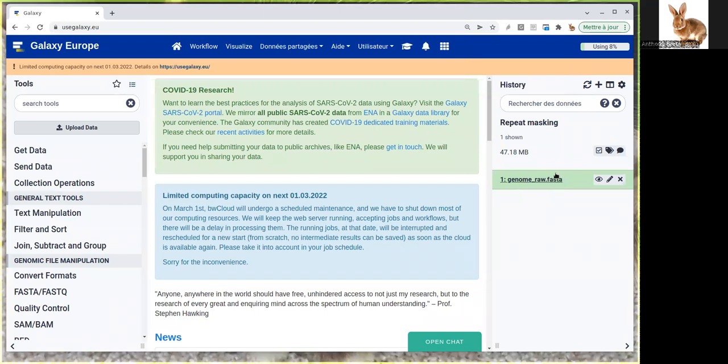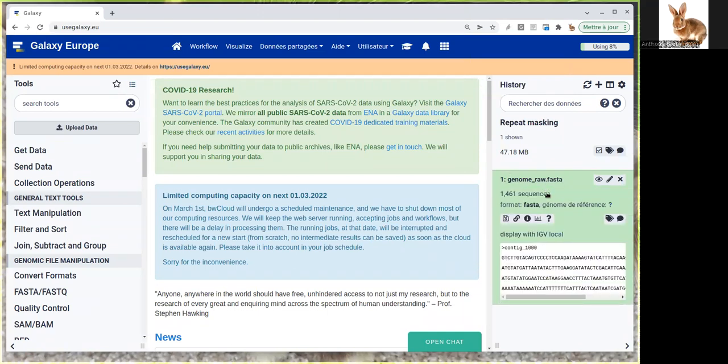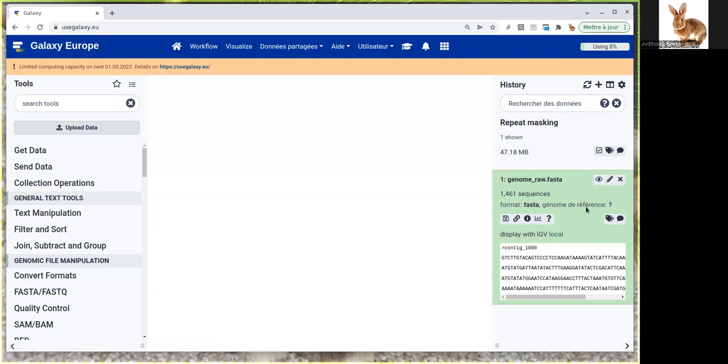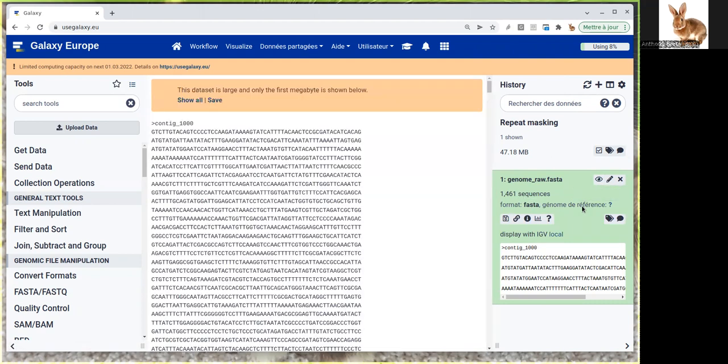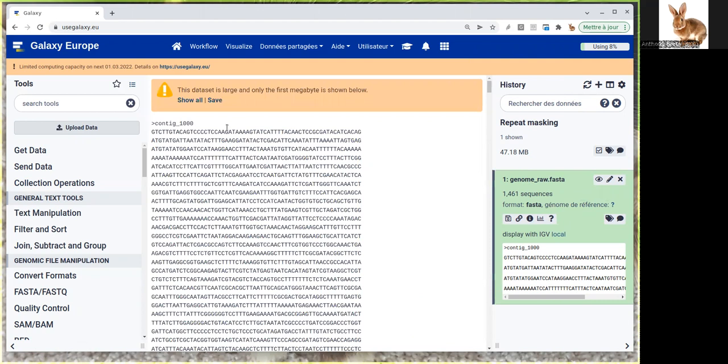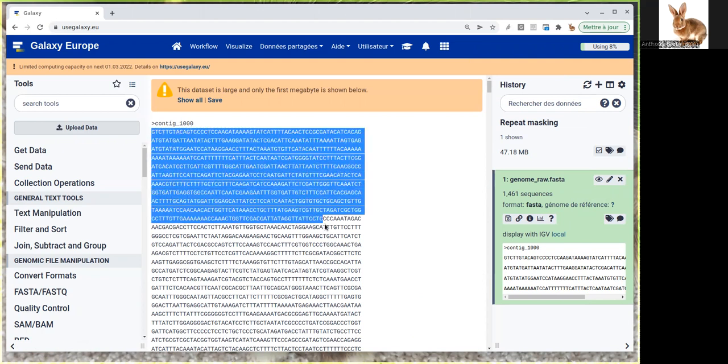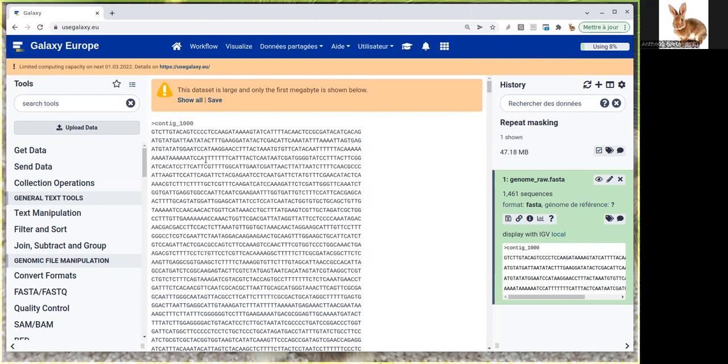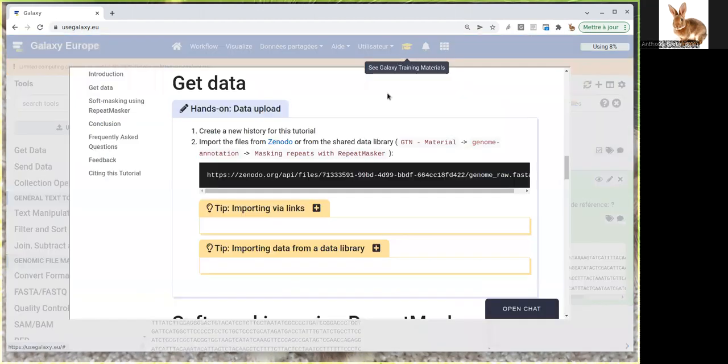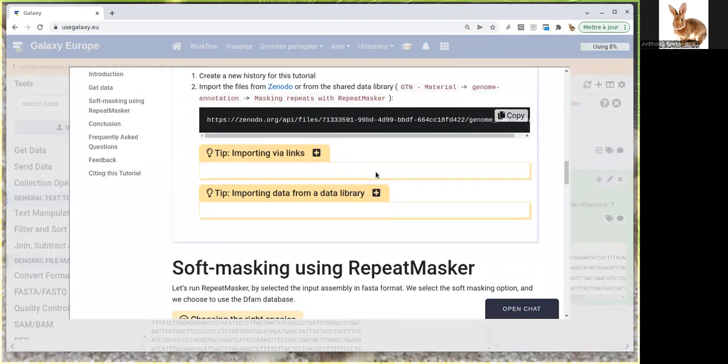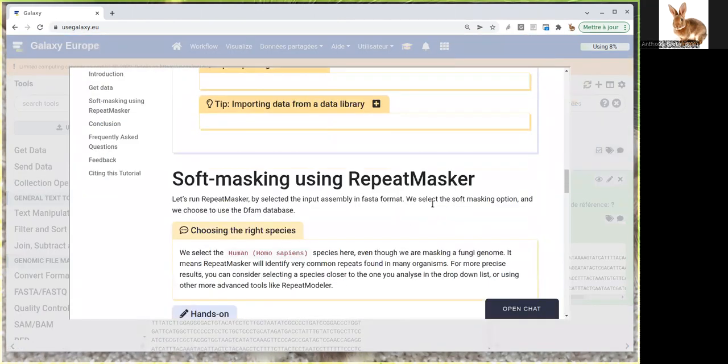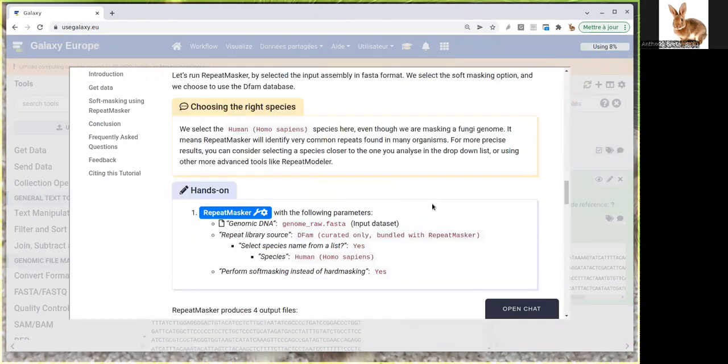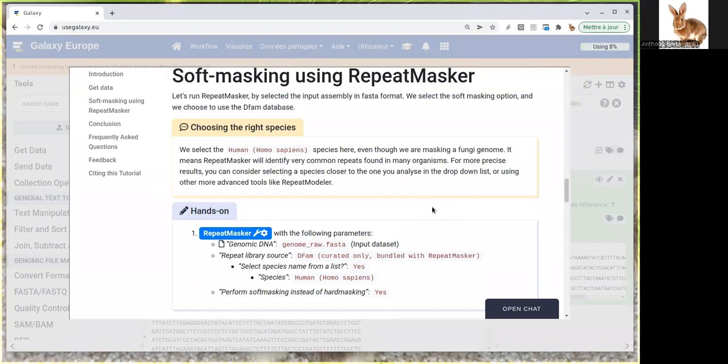Now that the dataset is green, you can see the FASTA sequence. If you look at it, you'll see the whole sequence which is in uppercase.